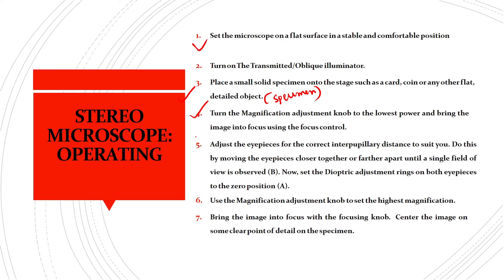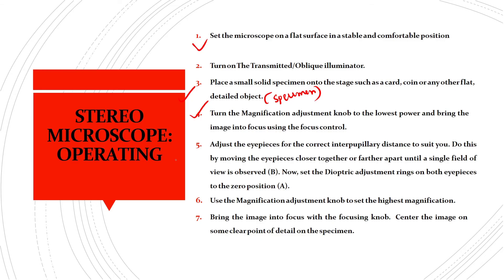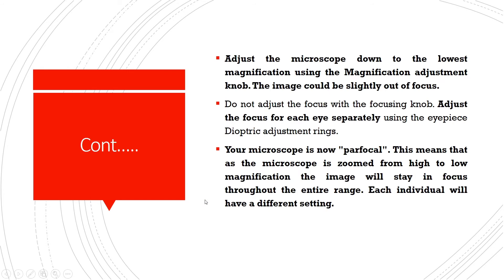Move the eyepieces closer together or farther apart until a single field of view is observed. Set the diopter adjustment rings on both eyepieces to zero. Then use the magnification adjustment knob to set the highest magnification and bring the image into focus with the focusing knob, centering the image on a clear point of detail on the specimen.